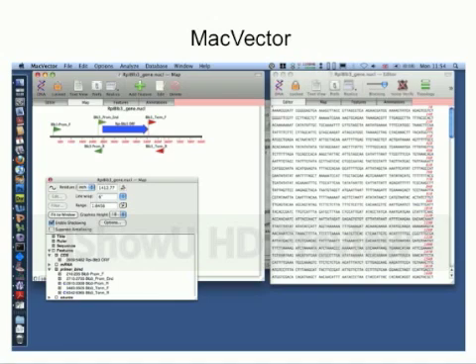This is pretty simple, really. You just copy and paste your sequence in, and then highlight the sequence, and then make it into a feature, and then you can assign different features for that particular sequence based on what they are. For example, in this one, I have a BLD3 sequence. This is a gene sequence with no introns. And I've designed some primers to amplify the promoter region, and a little bit of terminator region. And then you can diagrammatically represent that.